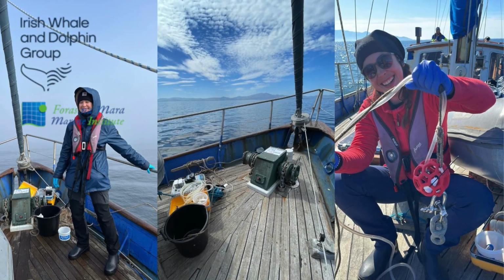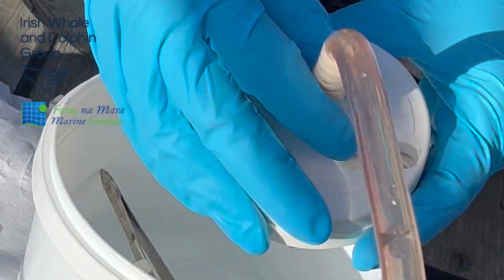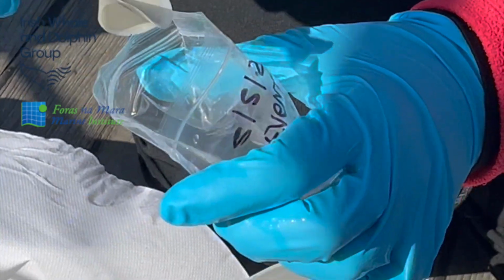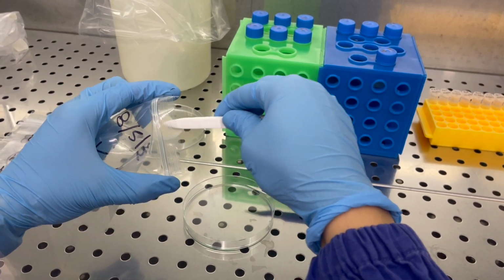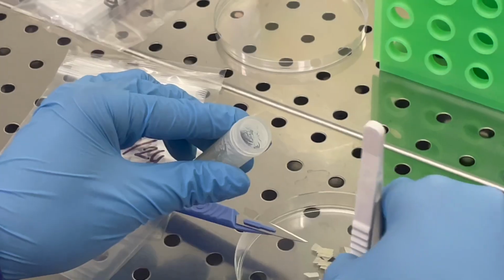We both use active and passive methods for sampling marine eDNA. Filters were then stored before starting with the DNA extraction process, once back in the laboratory. Different extraction kits were compared, evaluating the efficiency in terms of DNA concentration and the quality of the DNA extracted.